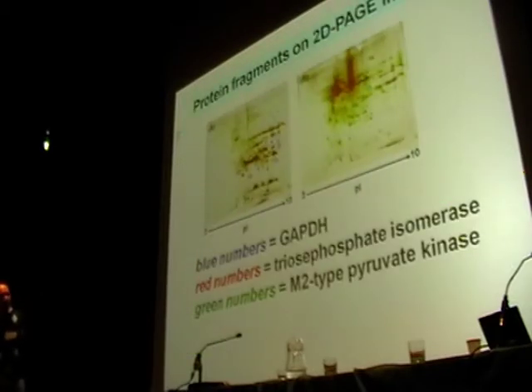So what happened, as I mentioned in the very beginning of this talk, the whole idea was to compare premature senescent cells versus control in terms of, again, which proteins were up, down regulated, or not changed. But at different steps of separation of these proteins after modification, we noticed that some fractions are really enriched with fragments of some proteins.